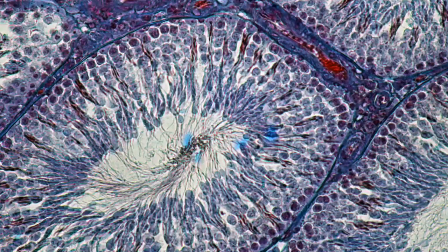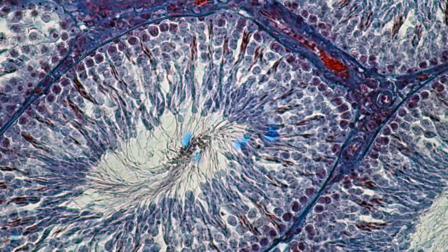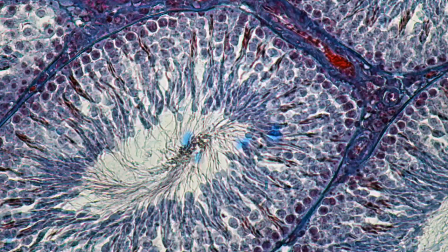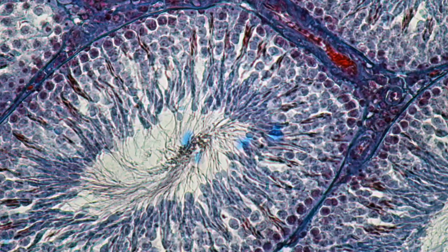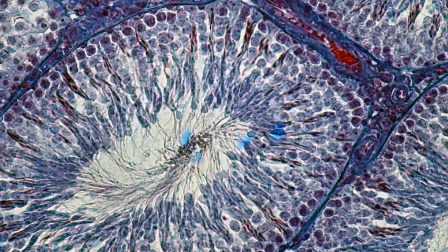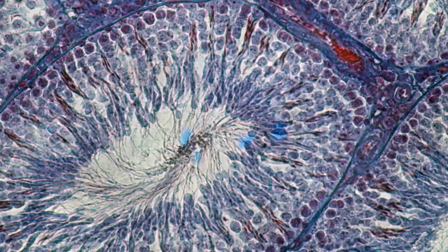Well, yet at a higher magnification, we can now see the sperm cells quite well. And between the tubules, if you look carefully, you can also see some red areas. And these are red blood cells because, of course, the testis tissue also has to be supplied with blood.